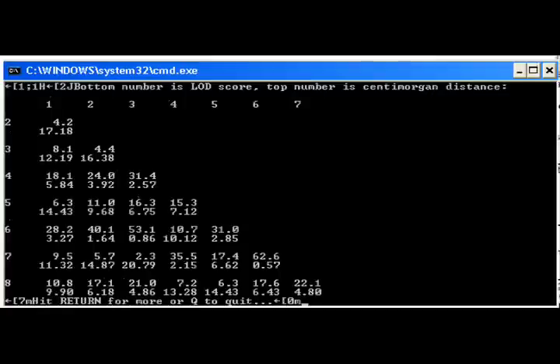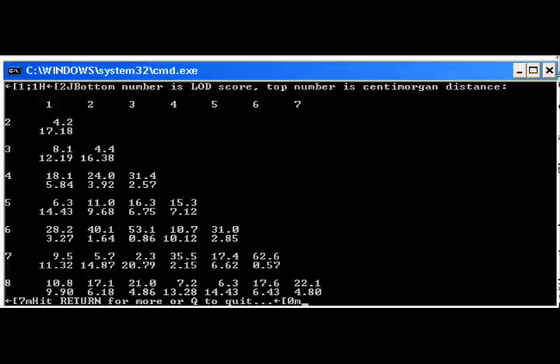The LOD command creates a table of centimorgan distances and the associated LOD value of that distance. We should select loci that are not too close but not too far apart. The loci selected are 1, 3, 4, 5, and 8.